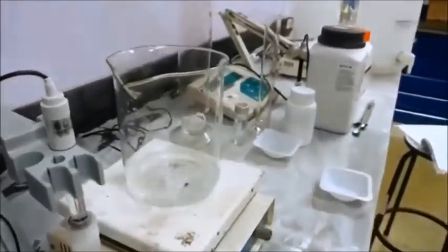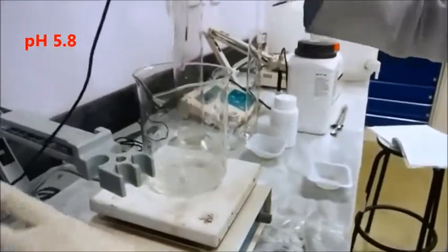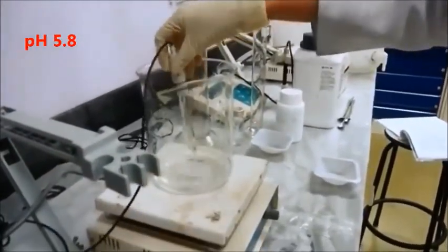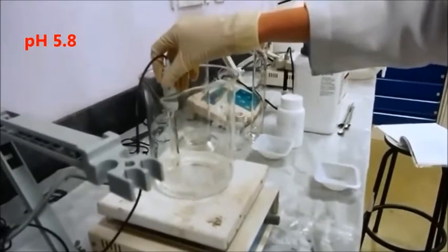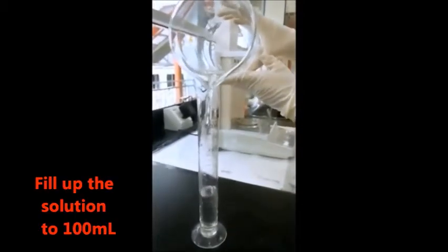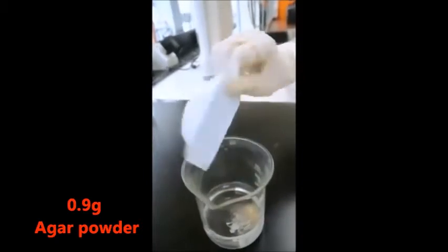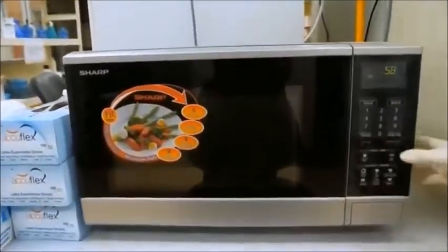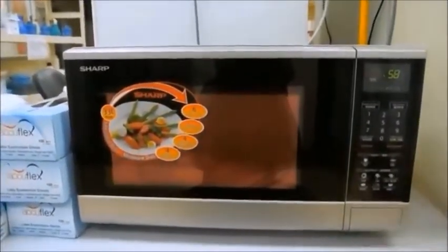After dissolving, the pH was adjusted to 5.8 using 1 N sodium hydroxide or 1 N HCl. By using a measuring cylinder, the volume was brought up to 100 ml. Then 0.9 g of agar was added.